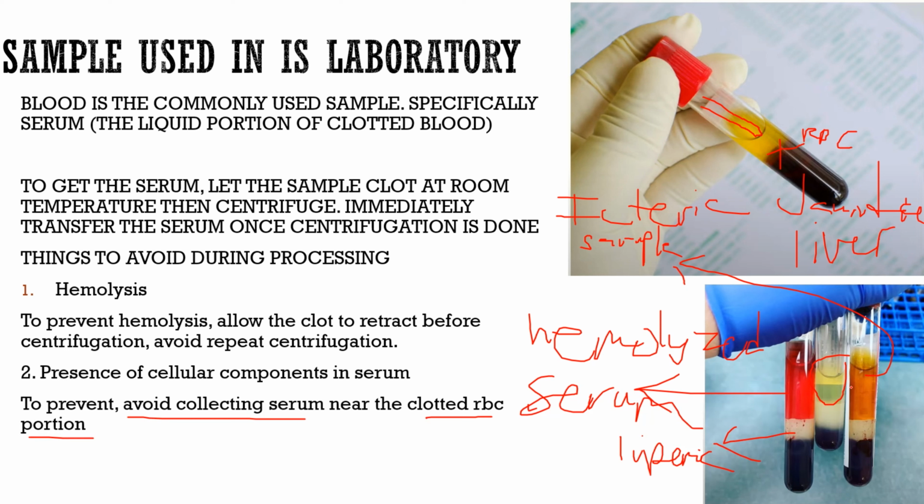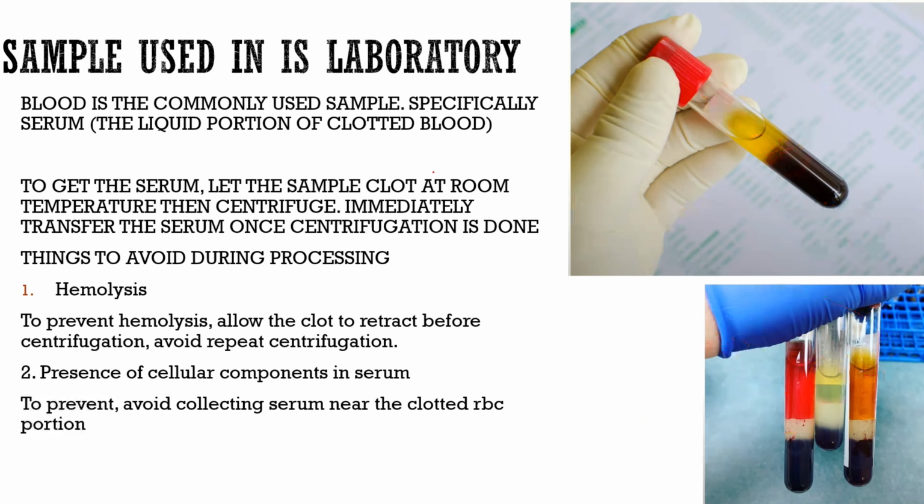You could still use that for immunosero, but we prefer, class, as much as possible, the clear, ideal serum. So that's the thing to reconsider. This is just a review, class. You are already familiar with this from your previous lab.